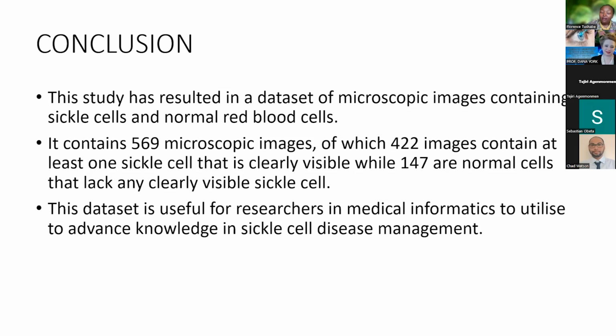I read in the literature review that in some advanced countries, every child is tested for sickle cell at birth as a routine. But for us in resource-constrained countries like Uganda, we don't have the money to test every child for routine sickle cell status. So now this can help us because it is a cheap way of diagnosing sickle cell.